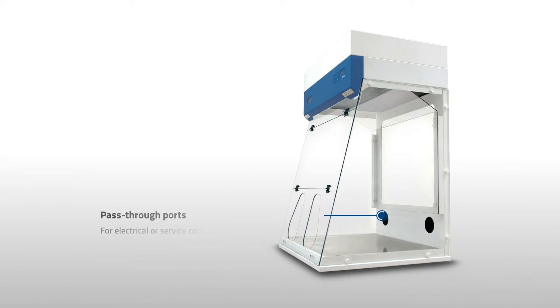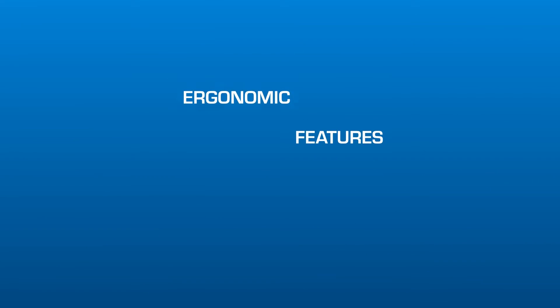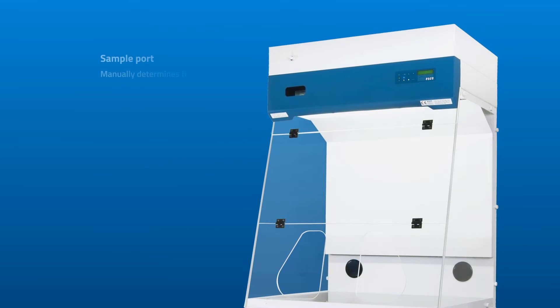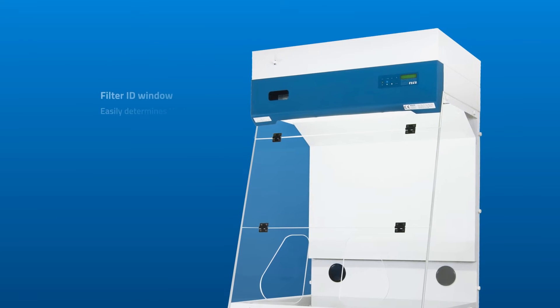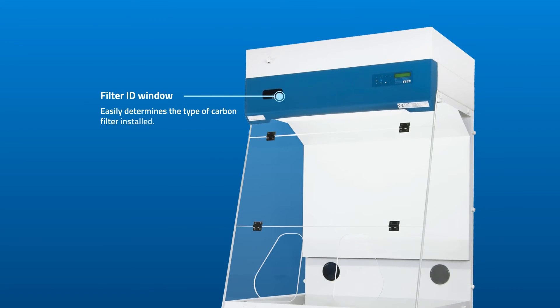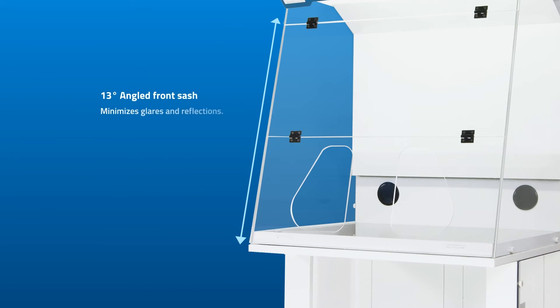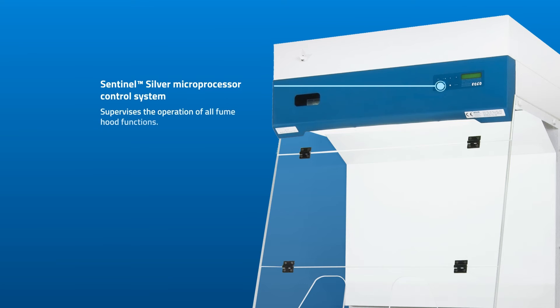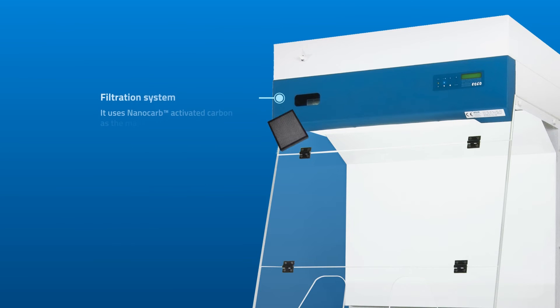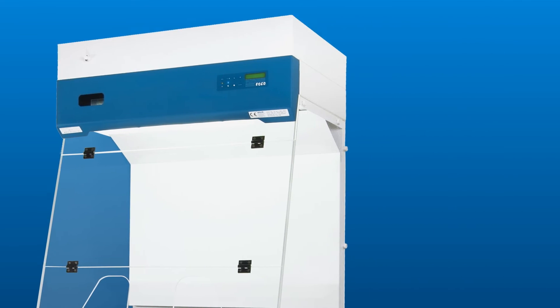Pass-through ports for electrical or service connections and a stainless steel worktop are included. Ergonomic features include a sample port that manually determines filter saturation through color tubes, and a filter ID window.